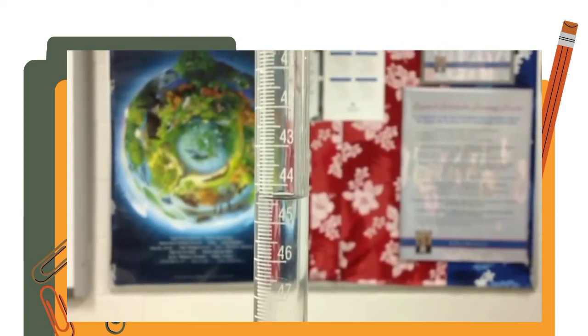And now we're going to read the amount of NaOH that we use in this titration, and that gives us 44.4 milliliters, reading 44.4 milliliters. So yeah, almost same process.